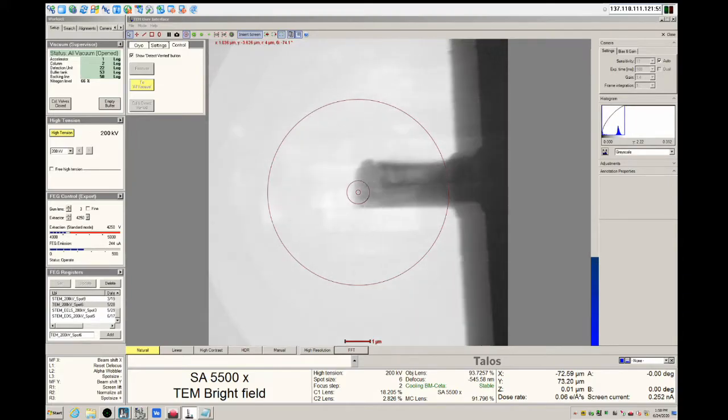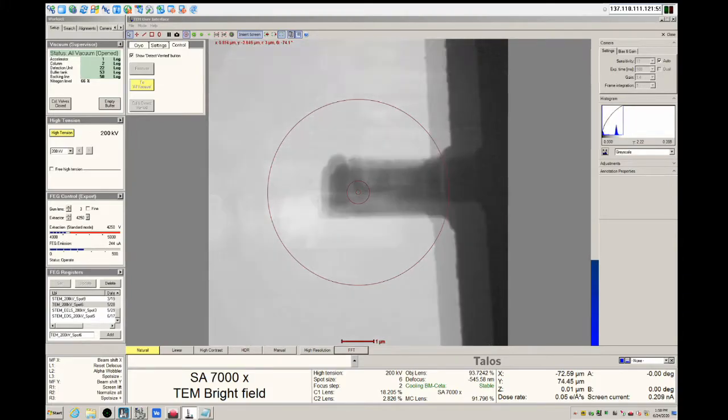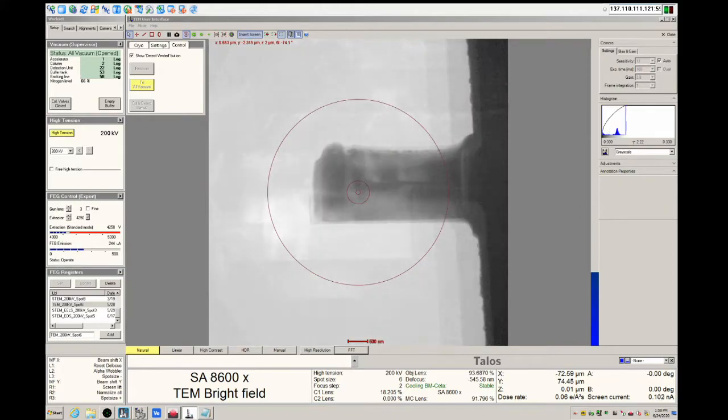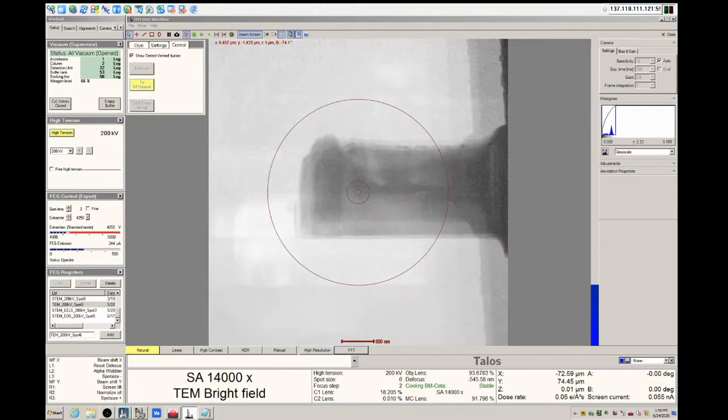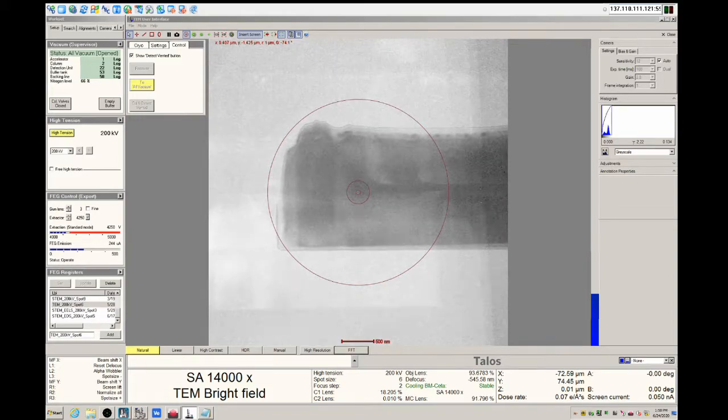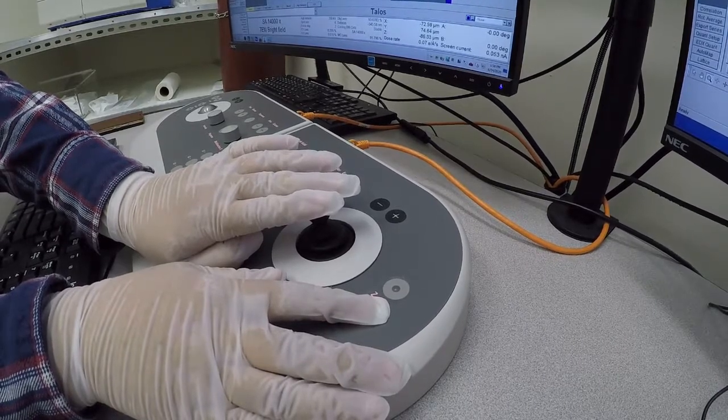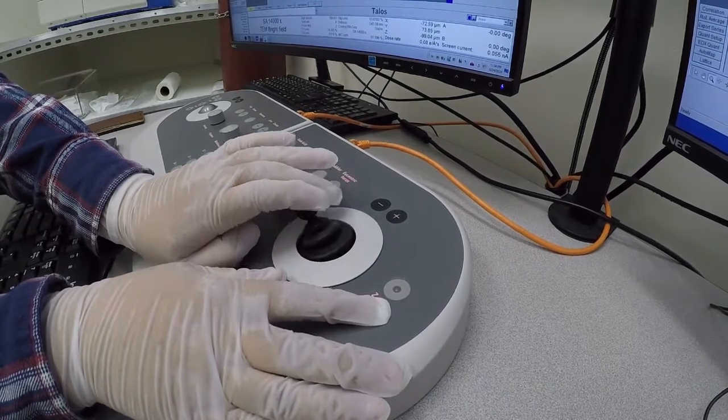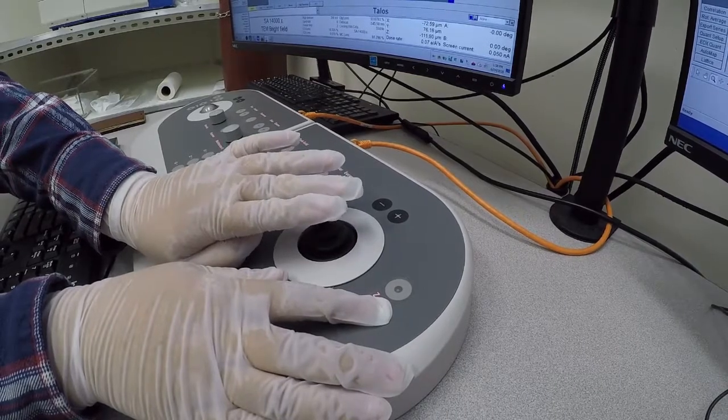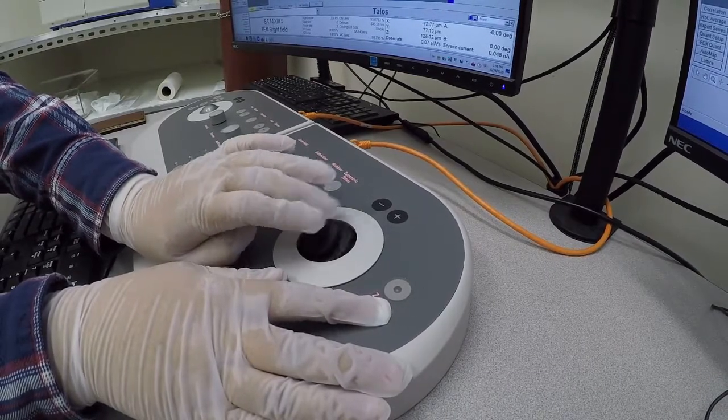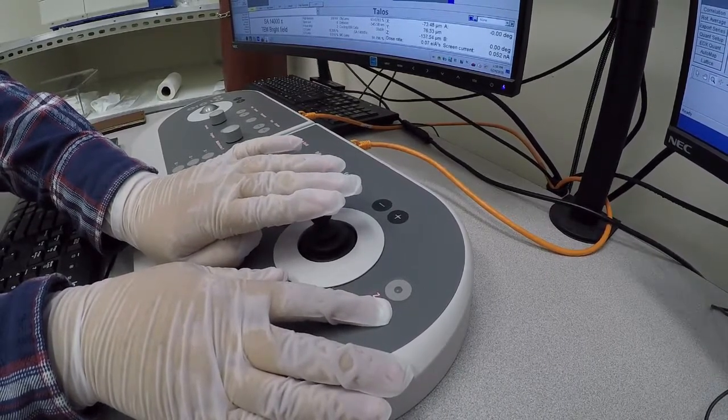The next step is to set the eucentric height. There are a number of ways to set the eucentric height, but one of the quickest and simplest ways is to adjust the stage Z whilst monitoring the contrast of your sample area of interest. Adjust the stage Z using the buttons on the control pad, and use the joystick to keep the sample near the center of the screen.